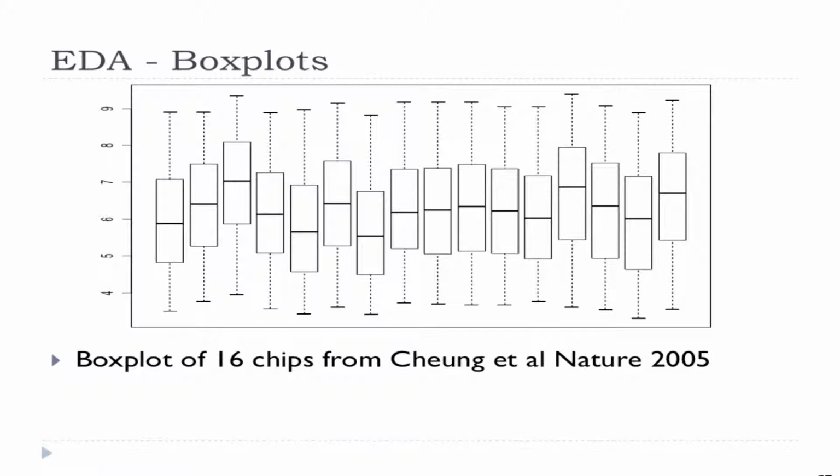And we start with arrays. These are box plots of the intensities from the Affymetrix microarray data that you guys are going to be working with this afternoon. If we're doing differential expression, do you think that this is something we want to start with? Look where the medians are. These things are off by quite a bit.